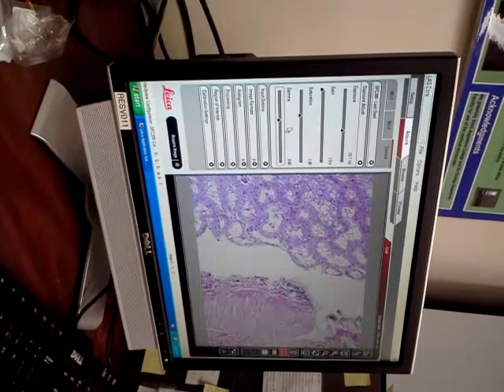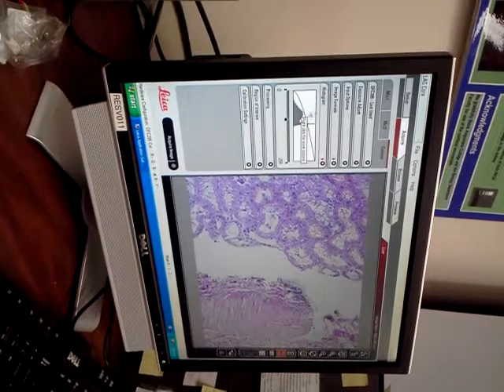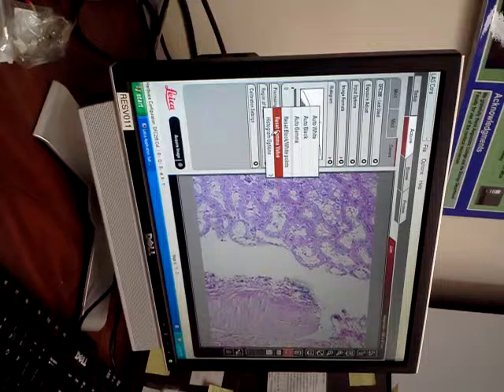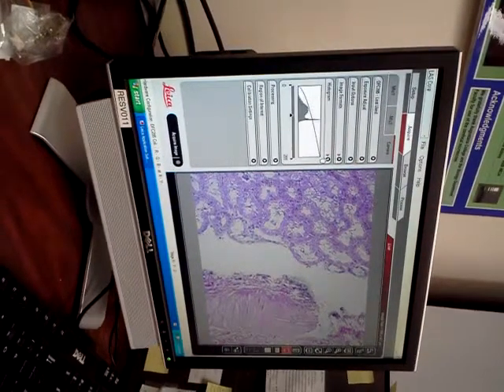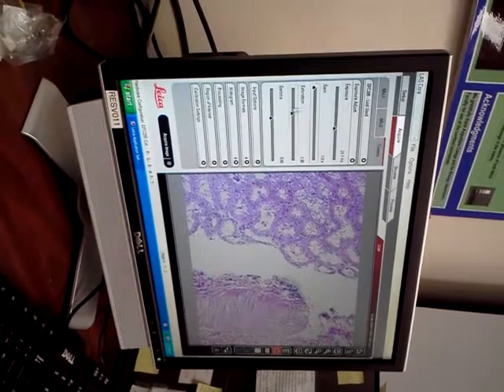Is there a way to get back to default if you start screwing around and go, oh crap, how do I get back to default? Yep. So histogram, right click, reset black white points, and then do it again and do reset gamma value. Okay. Right there. But that's for the gamma only. Yep.